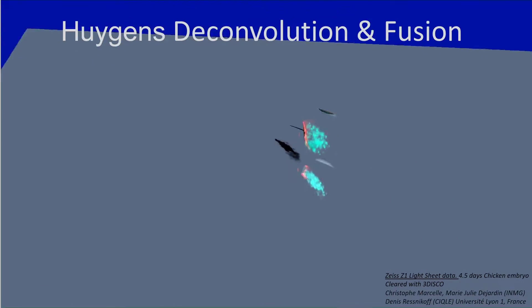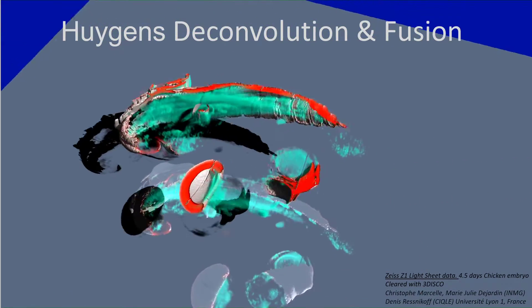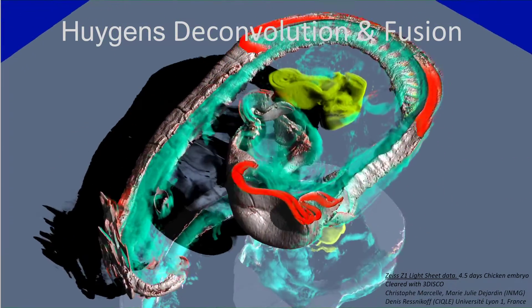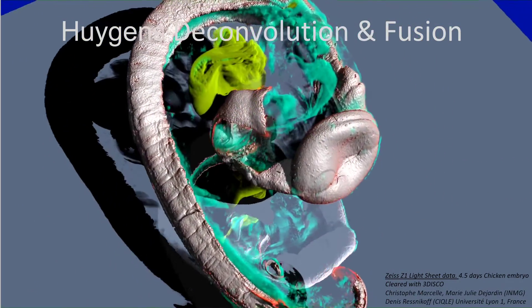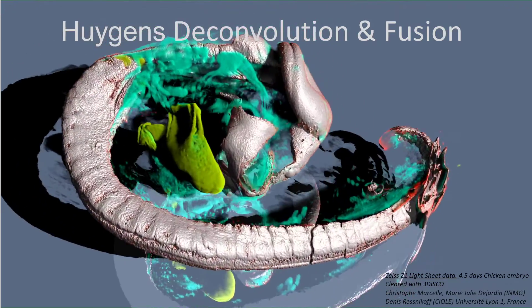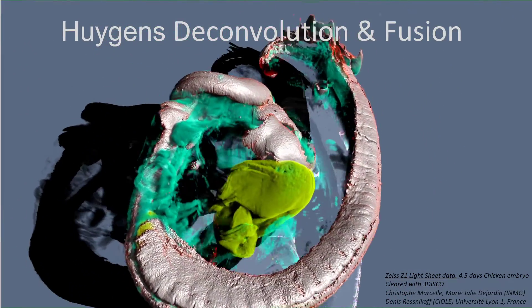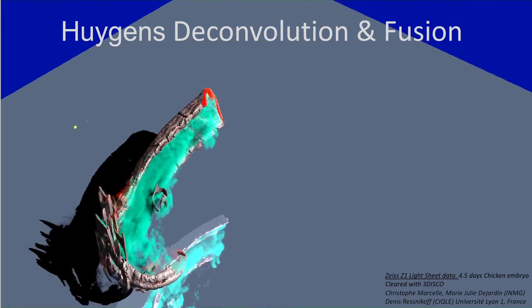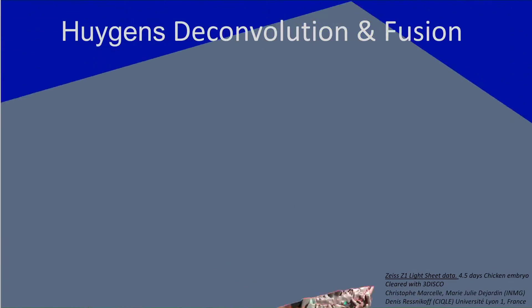Welcome everyone. This talk is about lightsheet deconvolution and fusion using SVI's Huygens software. This movie shows a chicken embryo where 12 tiled and rotated fuse were stitched and fused together using Huygens.